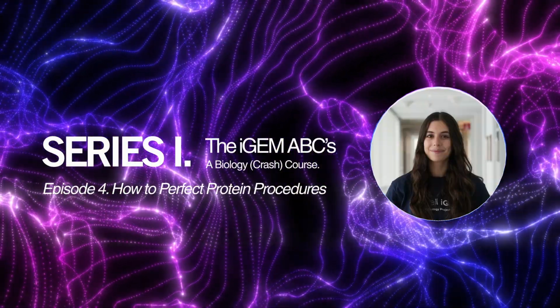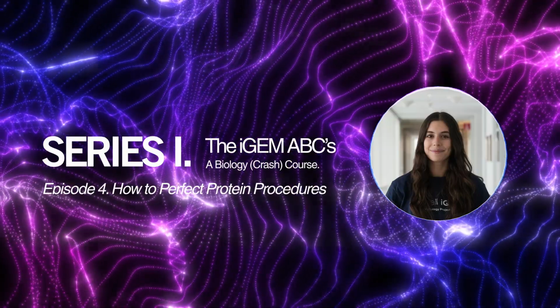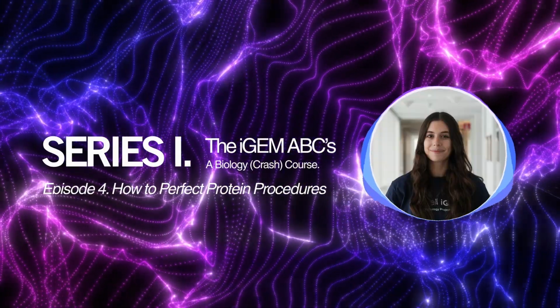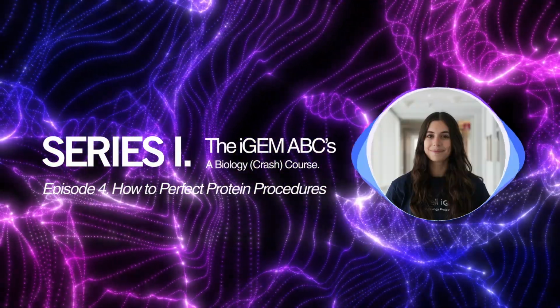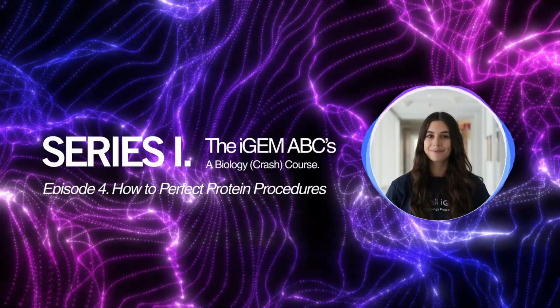In this chromatography technique, your lysate is passed straight through a porous column, and because this column contains pores that smaller proteins can stick in, but allows larger proteins to come straight out, you're going to have the proteins come out in a gradient that's inversely related to size, with the large proteins flowing straight through and the small proteins taking longer to get out of the column.